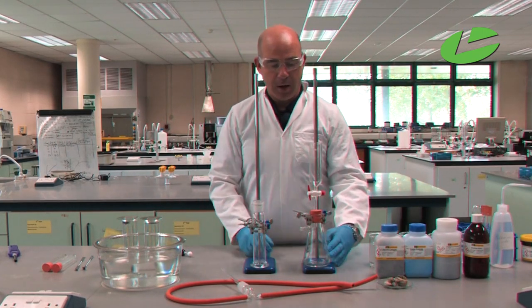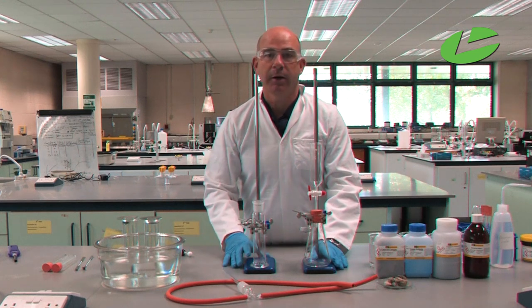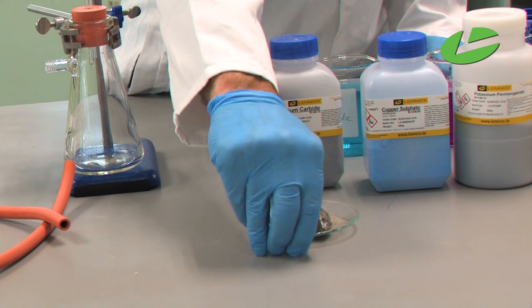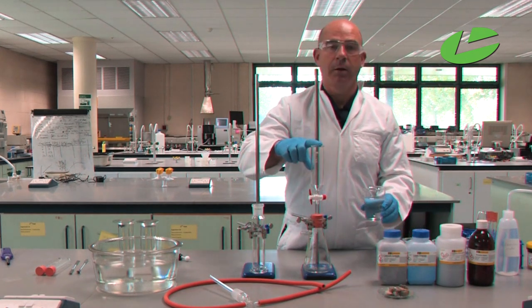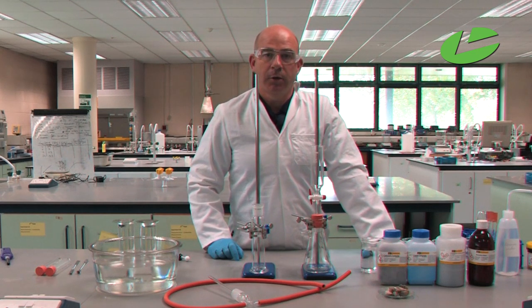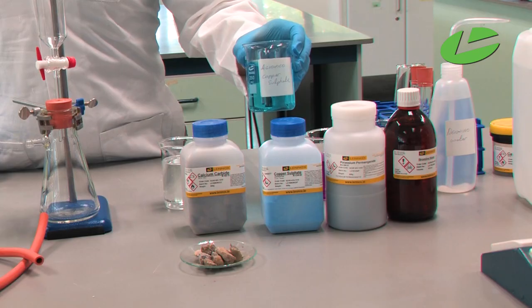In order to prepare ethyne gas you need the apparatus here. I have a buchner flask with a dropping funnel and a dreschel head into a collecting jar. The solid we're going to make the ethyne gas from is calcium carbide, which goes into the buchner flask, and deionized water goes into the dropping funnel. When preparing ethyne gas there are a lot of impurities, so to remove them you need acidified copper sulfate — copper sulfate mixed with sulfuric acid in the dreschel bottle.